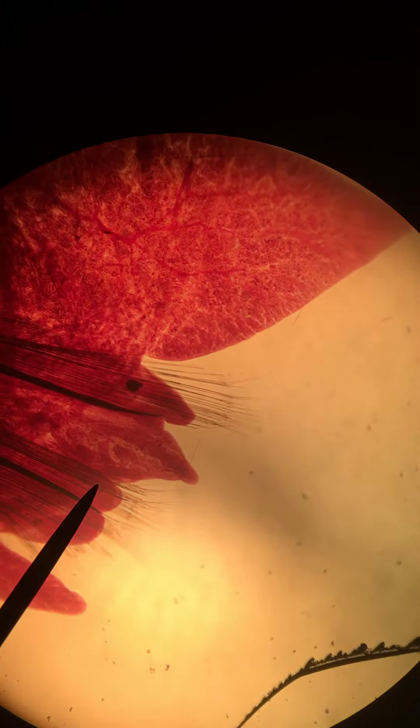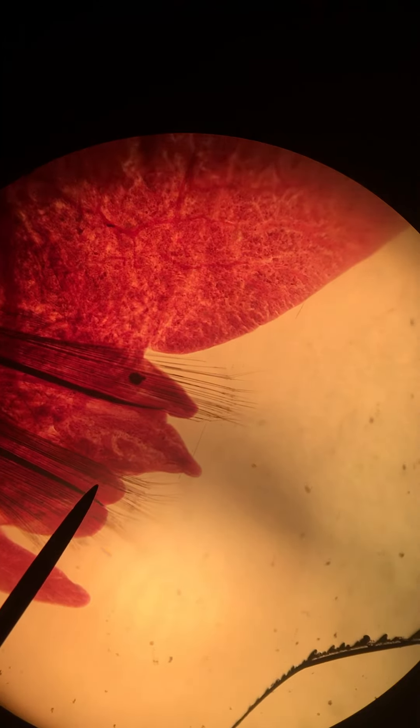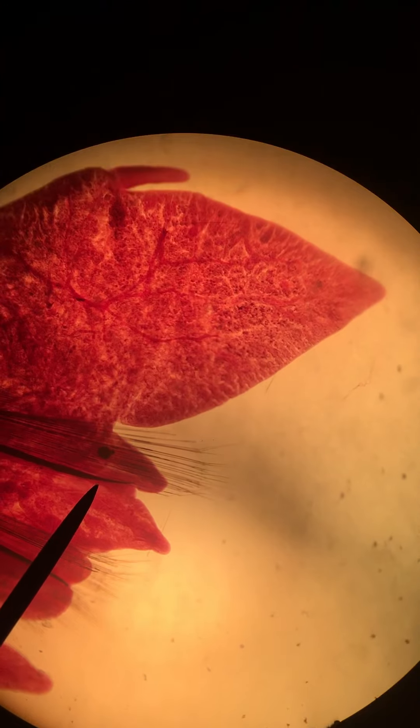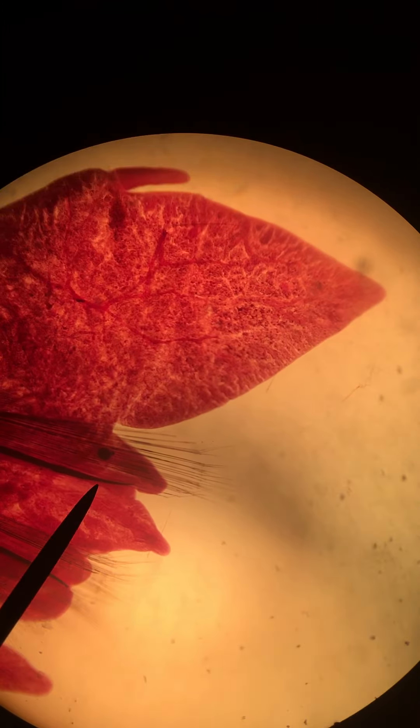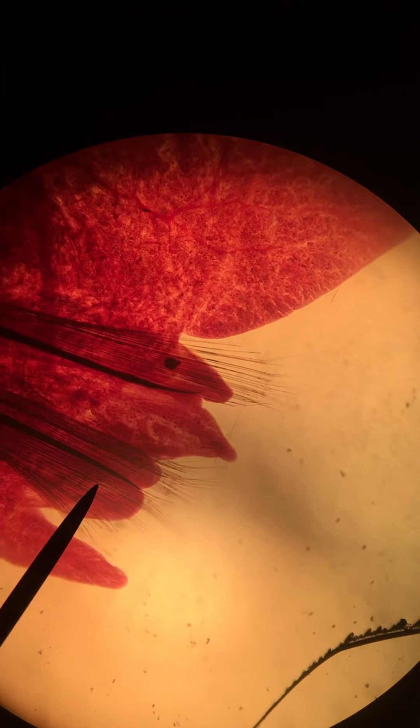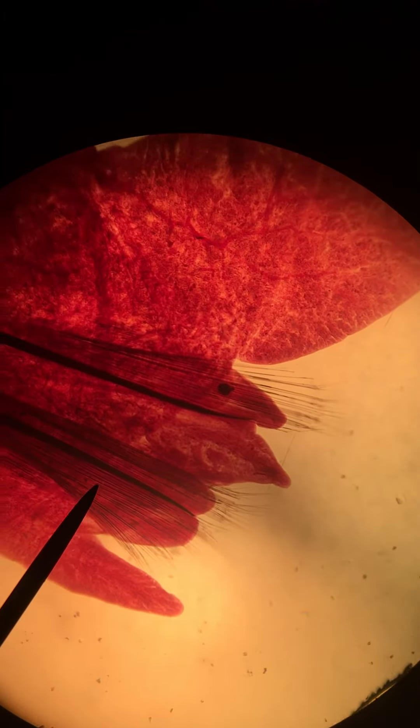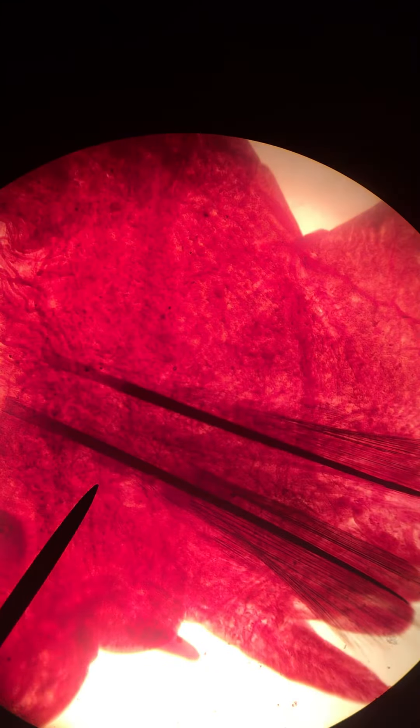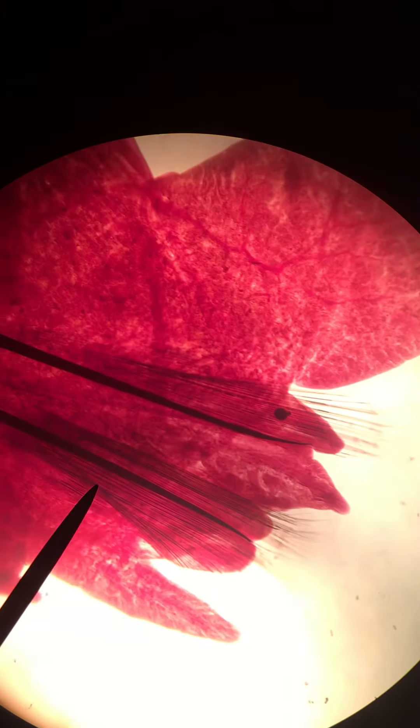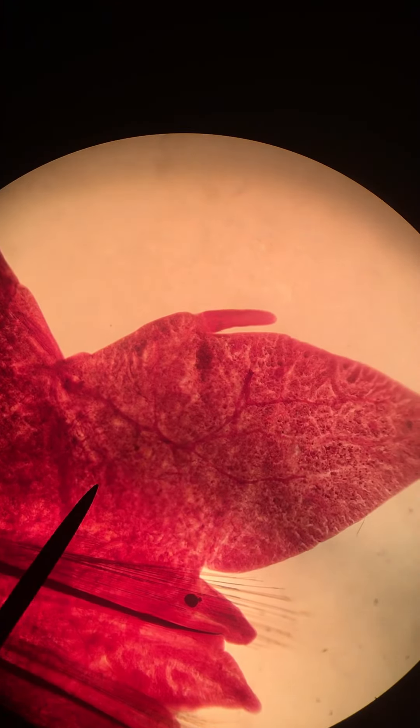And then these little fibers that you can see here, these are called setae. There's lots of little fibers that sort of branch out in both the notopodium and the neuropodium. There's two sets of those as well.